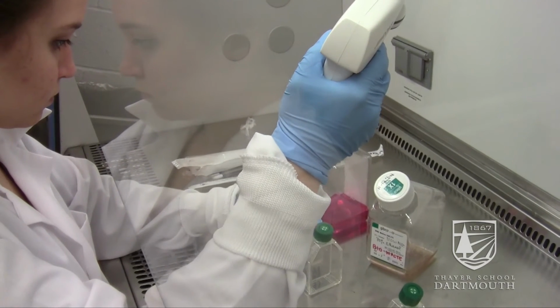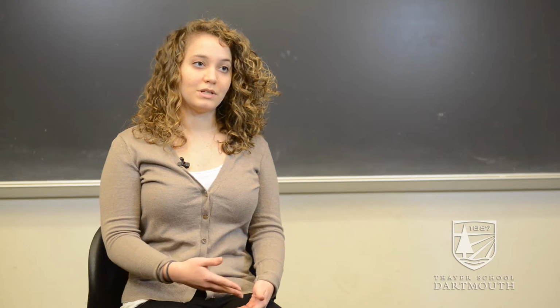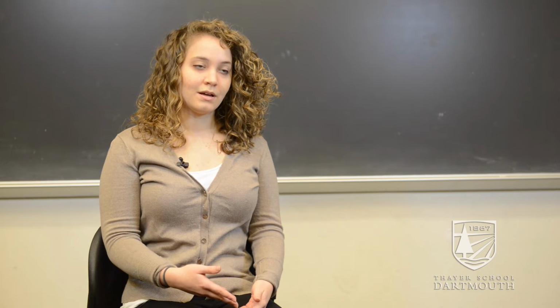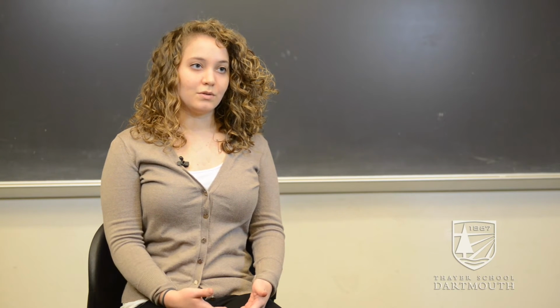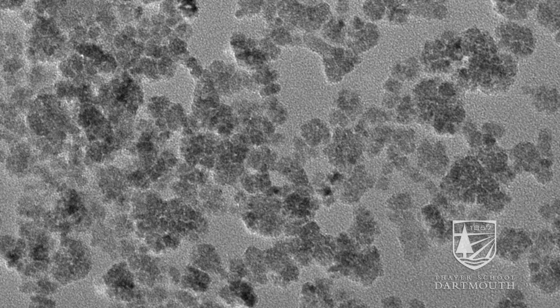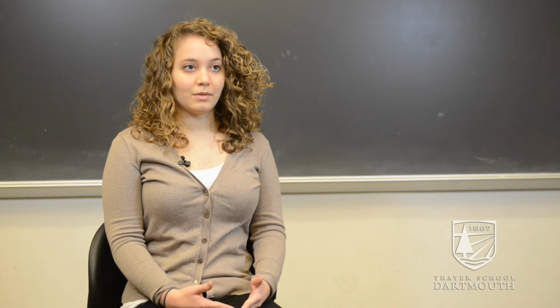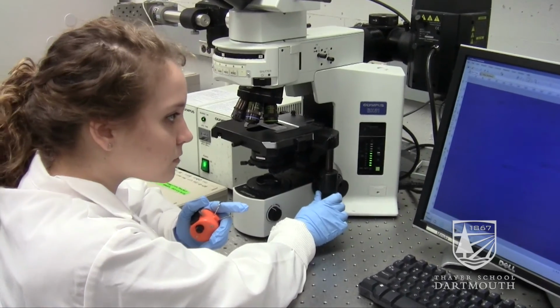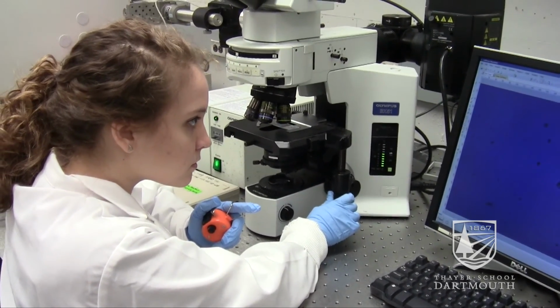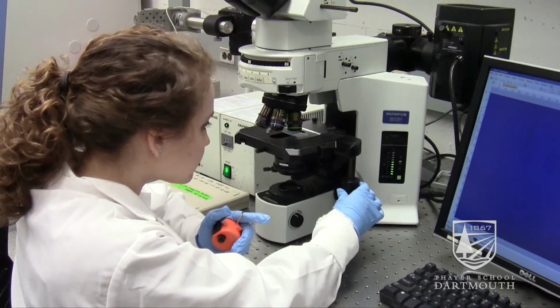And so we tag cancer cells with an antibody that is specifically targeted towards some protein that's being expressed on its surface. And the antibody that we use has been conjugated with magnetic particles. So by targeting the cancer cells with a specific antibody that now has magnetic particles on it, we give these cancer cells magnetic properties. And then in the lab, we have a machine that we run it through, which uses a magnetic field to try to capture the cells out of the source material and capture them onto a slide.